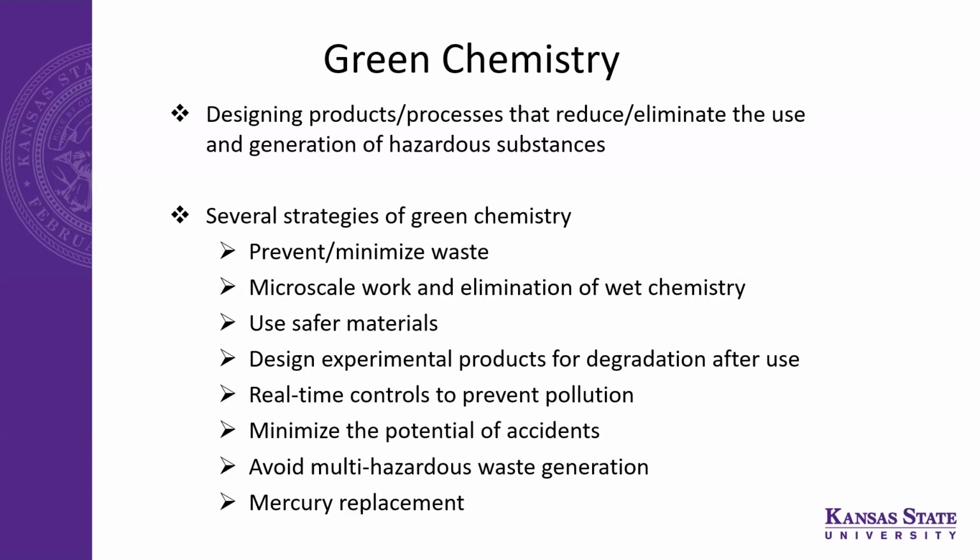So if there is a waste generator, can we dispose of it in a way without keeping it for a long time, like if that gives off a hazardous gas, which can cause some inhalation issues? So that's why the real-time controls to prevent pollution. Then minimize the potential of accidents.